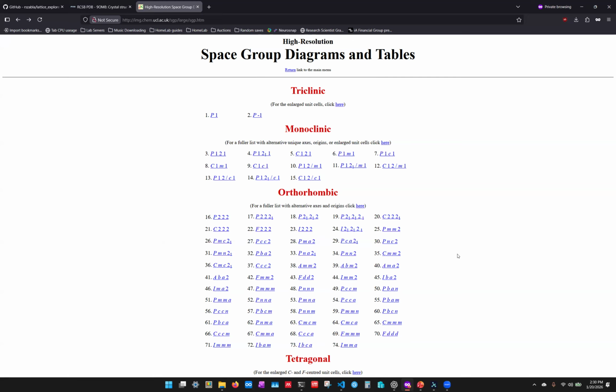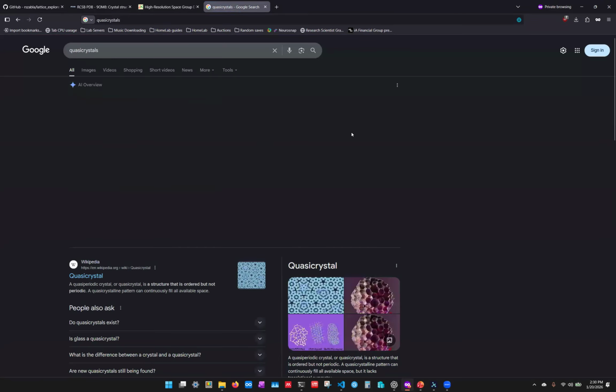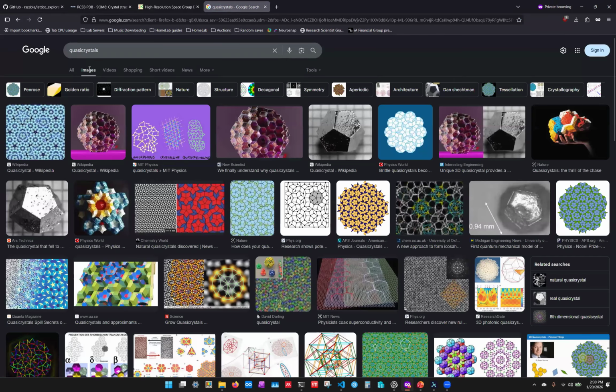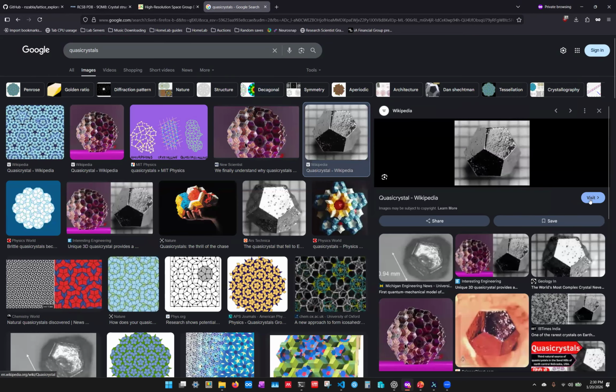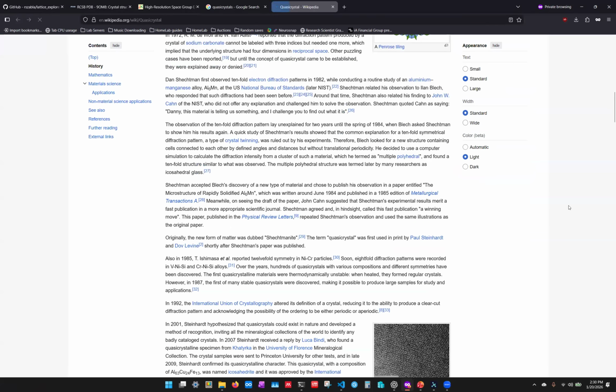So what do P5 crystals usually look like then? Actually, recently they grew quasi-crystals and they showed that you can get diffraction from it. It's pseudo fivefold. At least my understanding of what crystals could be, there's some impurities in crystals, no? Wouldn't those little gaps just be impurities that you can maybe get around?